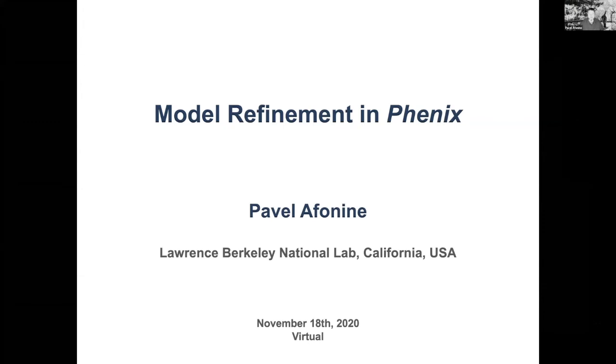So I'll try to do my best, cover basics and also some advanced topics, and we'll have some time to run tutorials and demonstrations. So feel free to ask your questions. Again, because it's nearly impossible to cover this large topic in about 1 hour, I'm really counting on your questions, specific problems and questions that you might have. Post them to the chat.